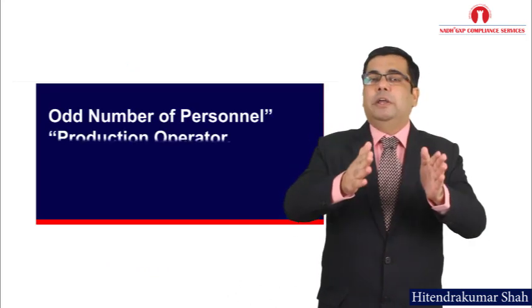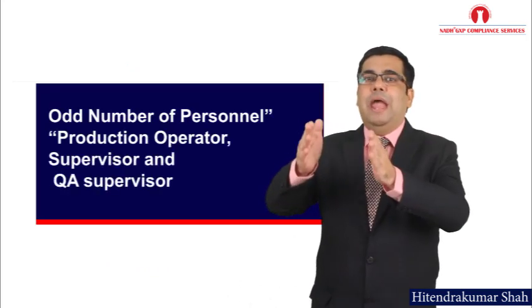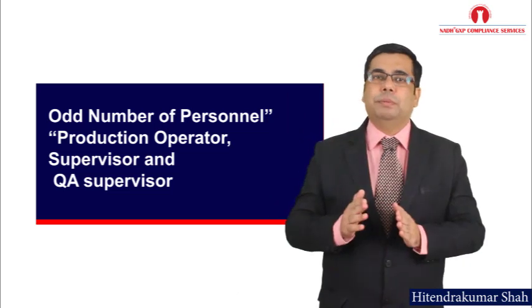Here, I suggest involving an odd number of personnel, for example maybe 7, for validation of the visual cleaning criteria. During routine cleaning, it is also checked visually by 3 persons, which is also an odd figure, and includes the production operator, supervisor and quality assurance supervisor.